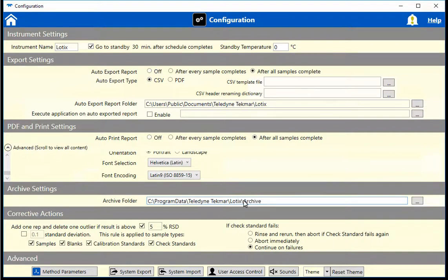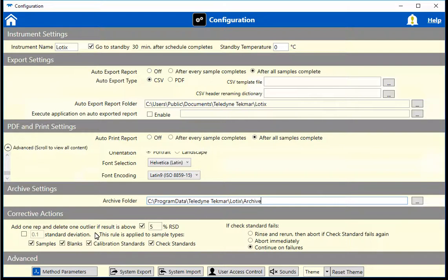In the Corrective Actions section, you have the ability to choose to add a replicate and delete an outlier that is outside a certain relative standard deviation. You can also apply that rule to particular sample types. Additionally, you have an option to choose what happens if a check standard should fail.